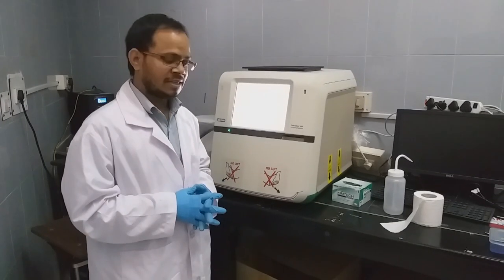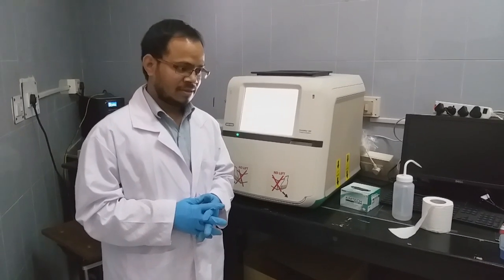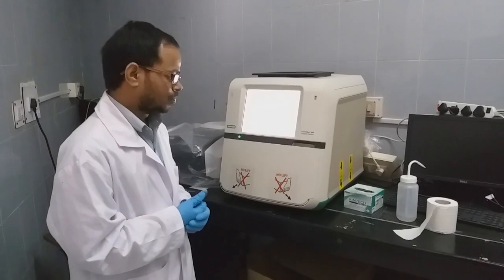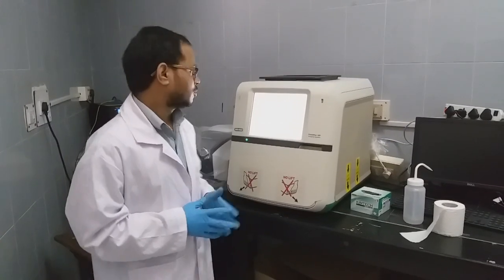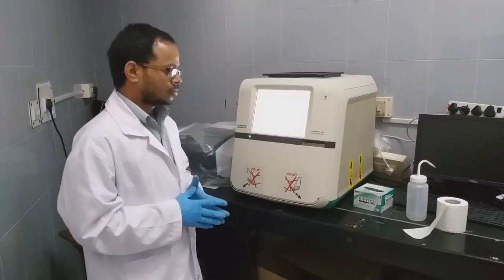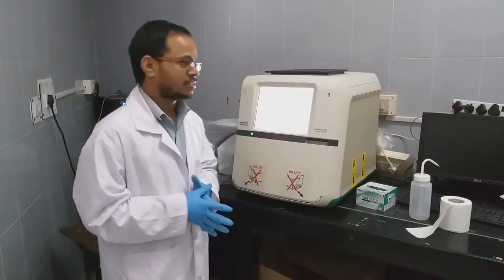We have run the gel, stained and de-stained. Now we will capture the gel image. We can see it manually also, but for record purposes we have to capture it through the gel doc. So this is the gel doc imaging system from BioRad. I'll show you how to capture the images.